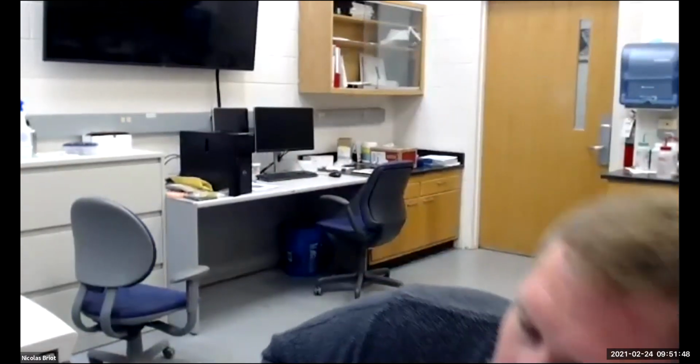And now the machine can calculate. I'm not going to get into the details, we don't have time, about how it's calculated, but the machine is calculating a composition based on the intensity of those peaks and everything. So right now it's telling me that it's almost 96% copper and a little bit of carbon and oxygen, which is just surface contamination. So if you would really clean the sample well before it goes into the machine, it would be closer to 100% copper.